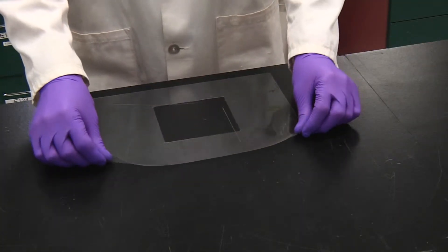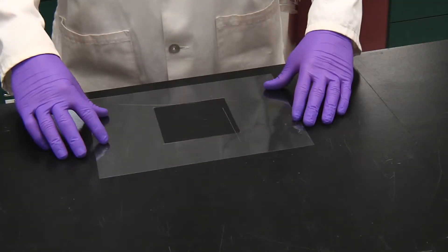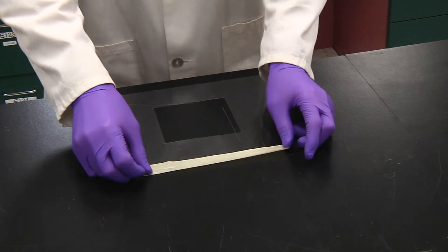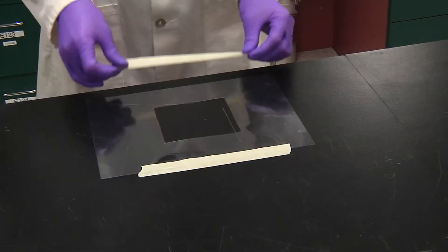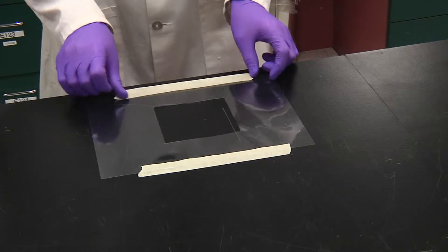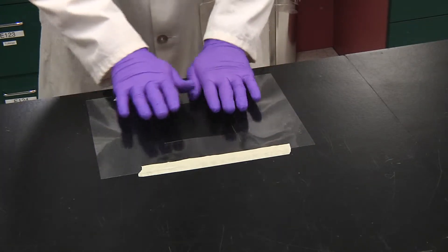When you've identified the surface to be sampled, place the sampling template on the surface and secure with tape. Make sure the template's secure and won't slip while you're sampling.